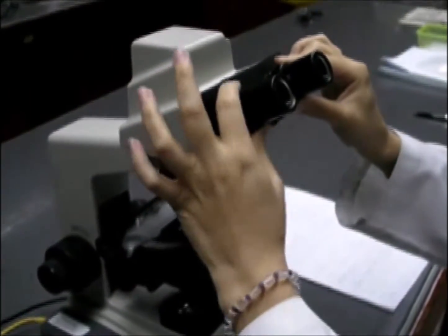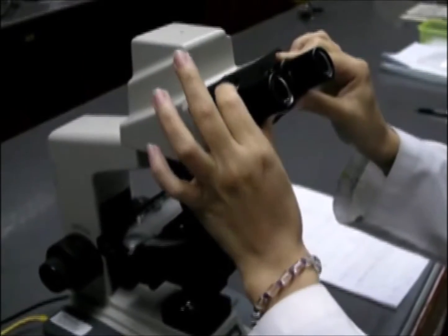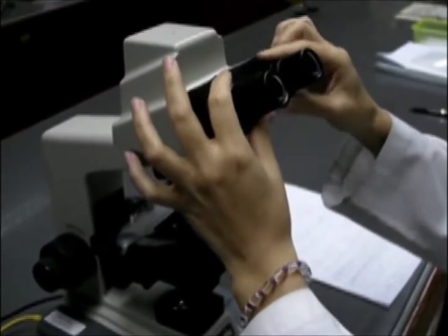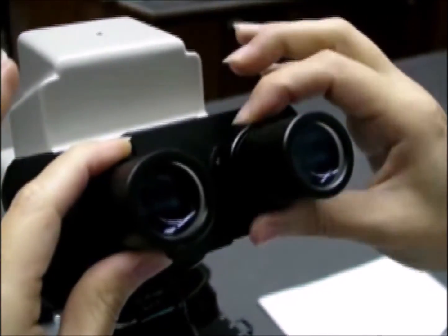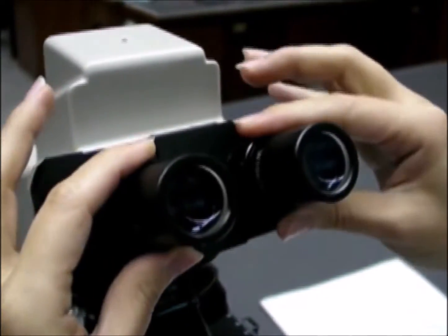Both the eyepiece lens can be turned to adjust the sharpness of the image in the microscope based on your short-sightedness, so that you can view the microscope without using your spectacles.